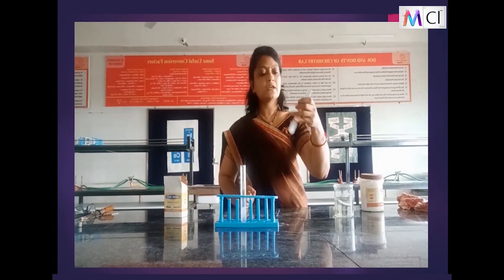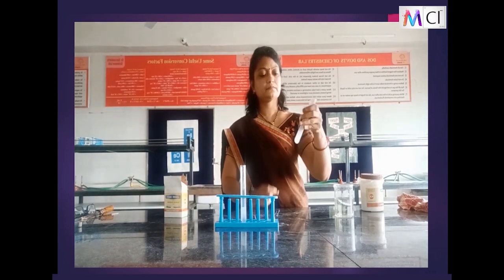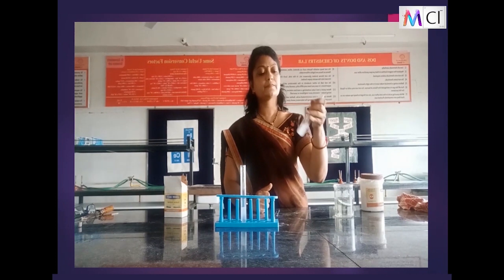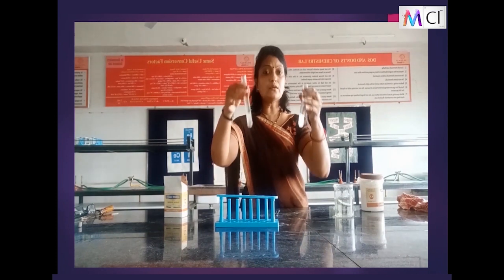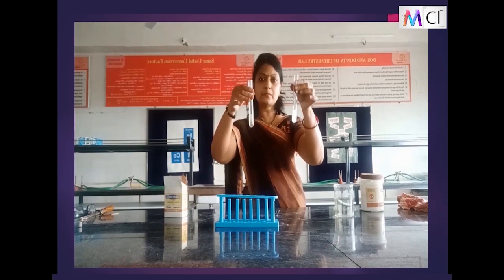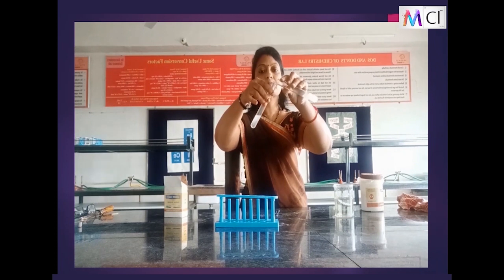Completely dissolve this barium chloride in the water by simply shaking it. Now, when I add this barium chloride solution to sodium sulfate, let's observe what happens.